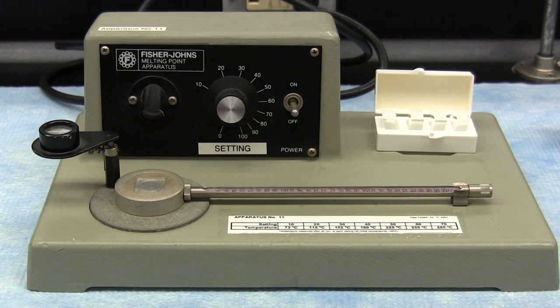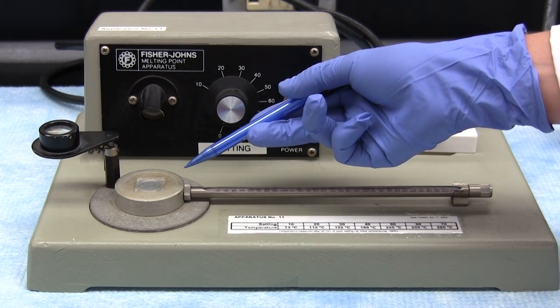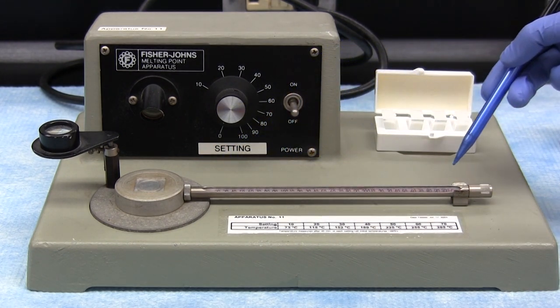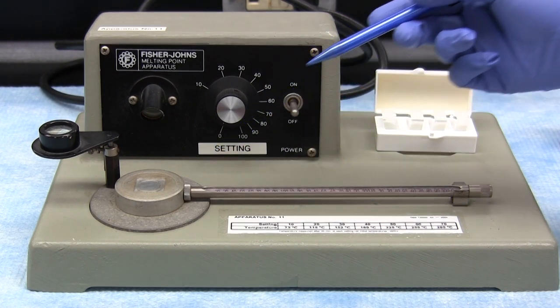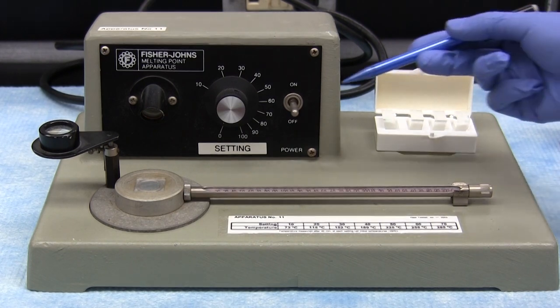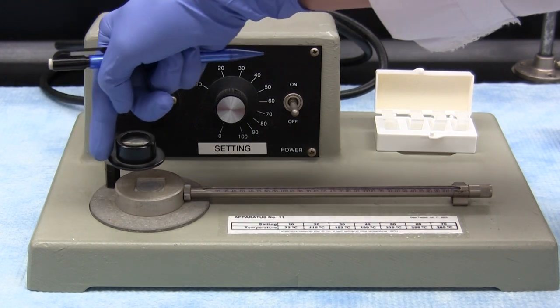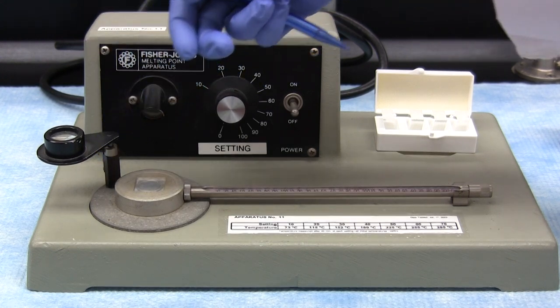Let's first look at the various components. The apparatus consists of an aluminum block called the stage or hot stage, and this can be heated and its temperature recorded by the thermometer, which is permanently in place. The sample to be melted is placed between two cover glasses in the center of the stage, and the magnifying eyepiece swings over to allow the crystals of solid sample to be viewed more easily as they are heated.